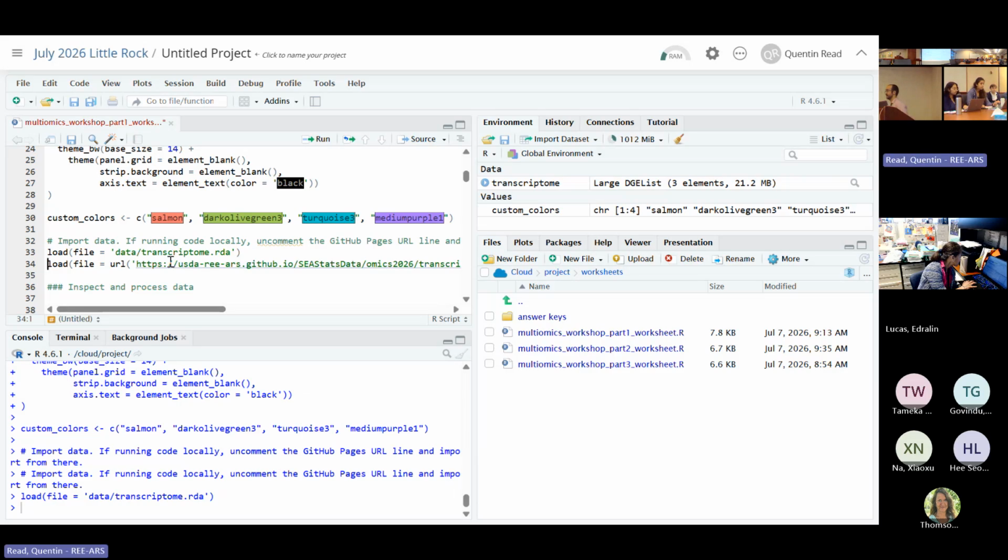Everyone good there? Yes. Some errors on... It's saying that it's not able to implement one of these packages. But line 34 did work, but these did not load. I see. Well, then you'll want to just install the ggplots package if it's not installed yet.